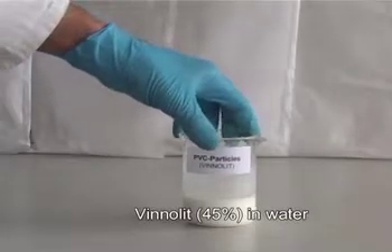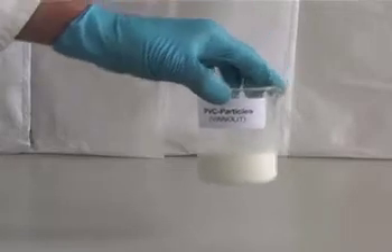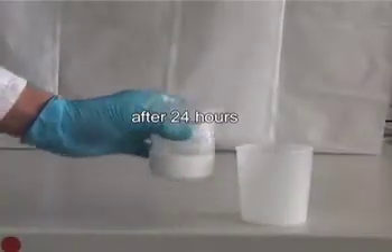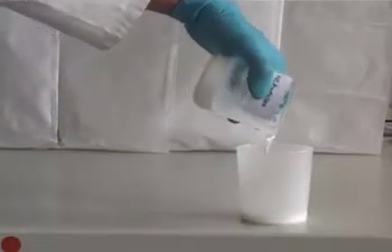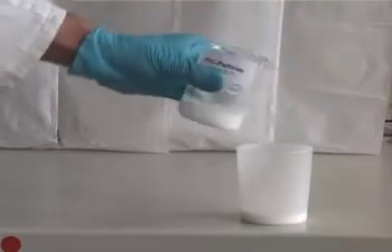For this admixture, we start with a water-based suspension of 45% volume fraction of hydrophobic PVC particles. The particles in this liquid-like mixture quickly settle to the bottom of the beaker, allowing us to pour off the water with only a few of the very smallest particles still in suspension.